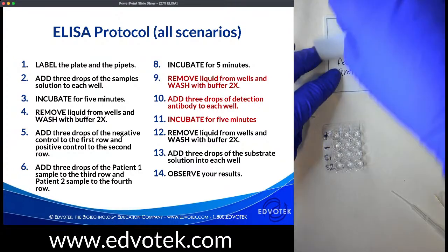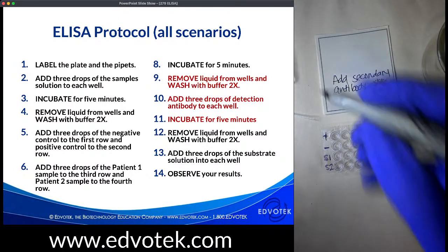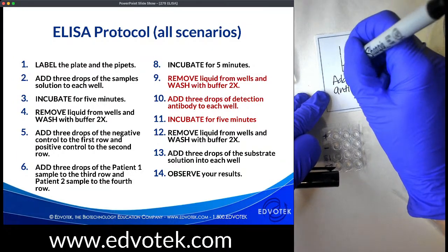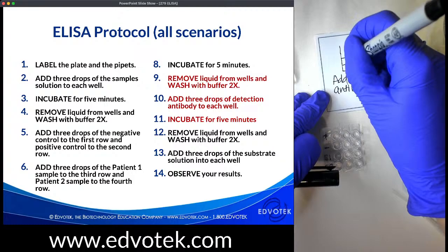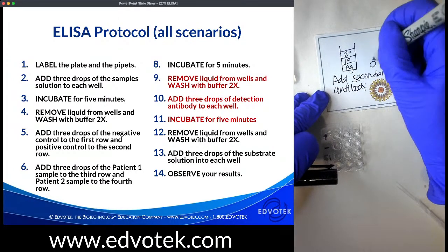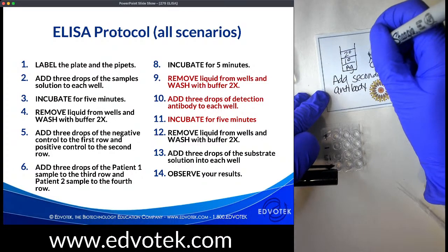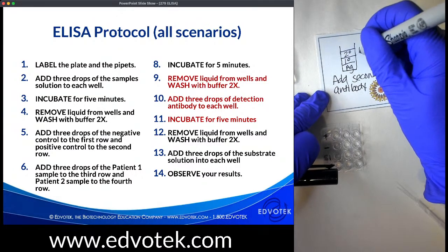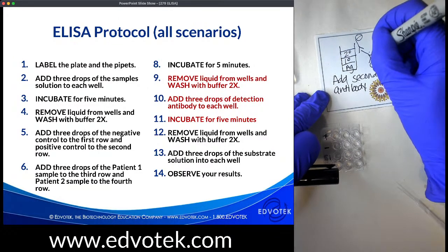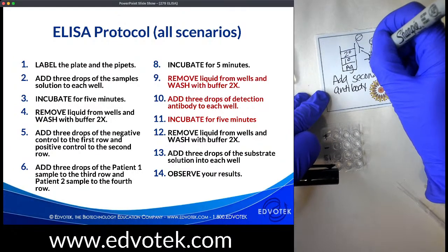All right, so I'm going to update our little graphic up here for adding our secondary antibody. So here we have our little test tube. I'm going to continue to make it larger. We have our antigen. We have our primary antibody. And now we're adding our secondary antibody. It would actually look more like this, right? So here is our antibody. And then we're going to have another antibody, our enzyme-linked antibody, hanging off of that. And maybe this is going to recognize all these different locations on this antibody.